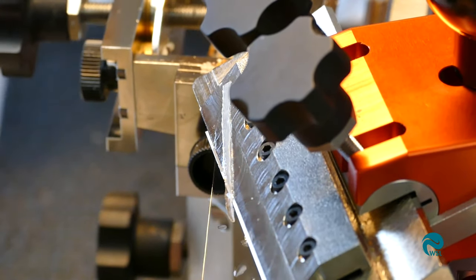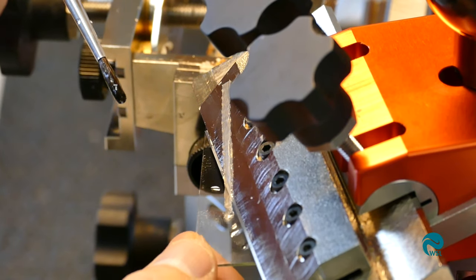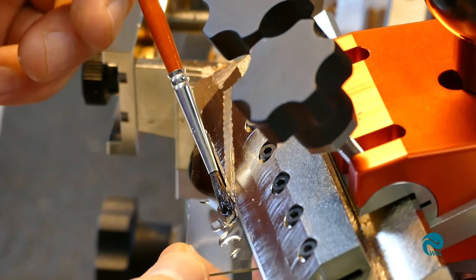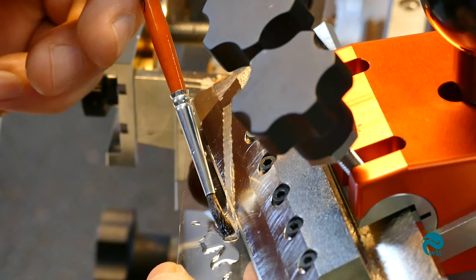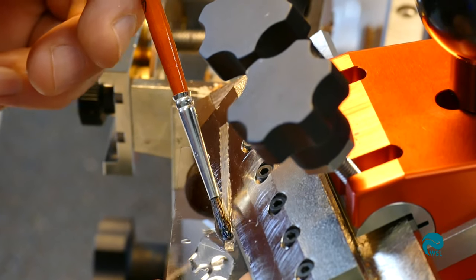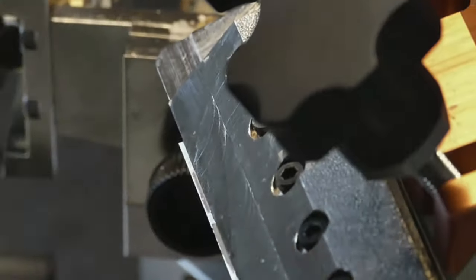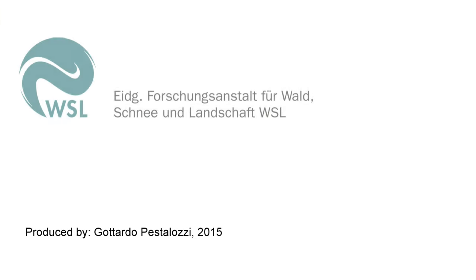The freshly cut section can now be removed from the blade and transferred directly to a glass slide using a paintbrush.